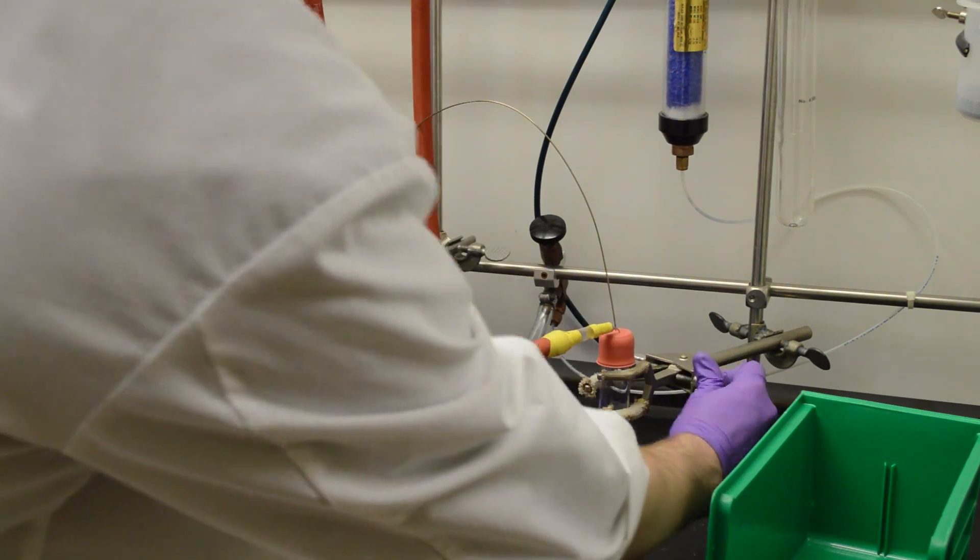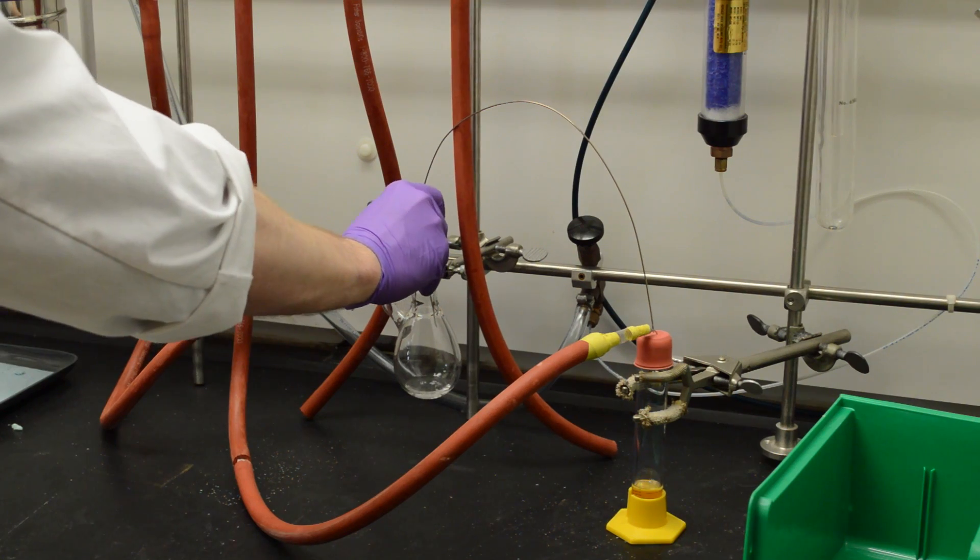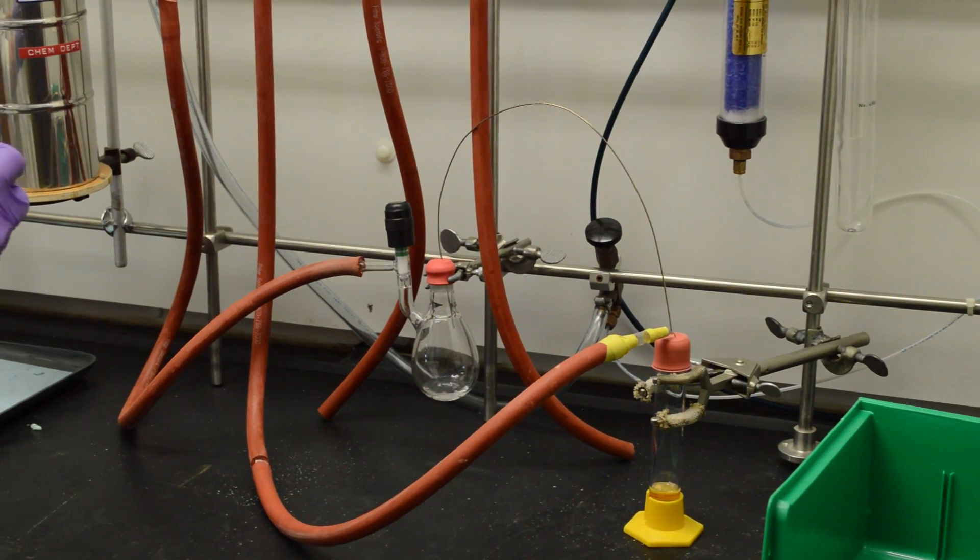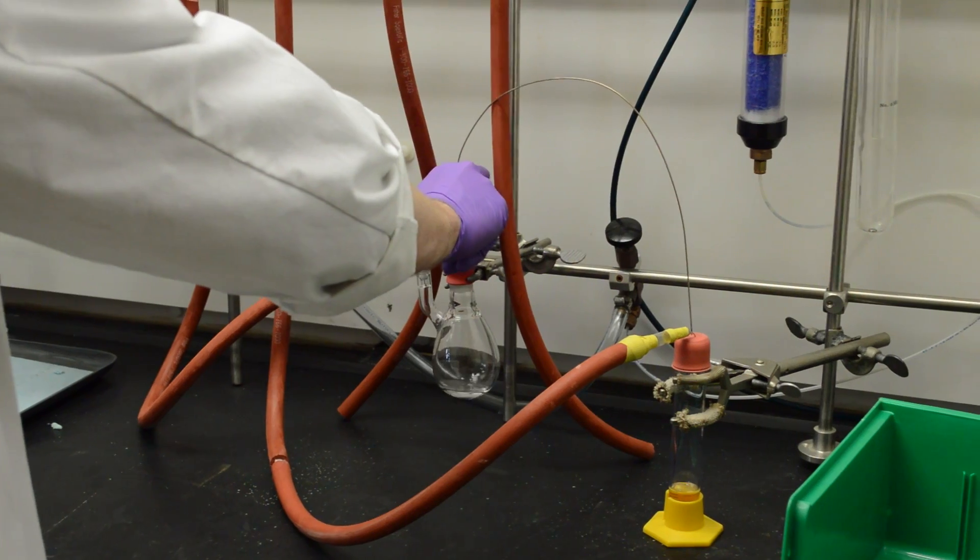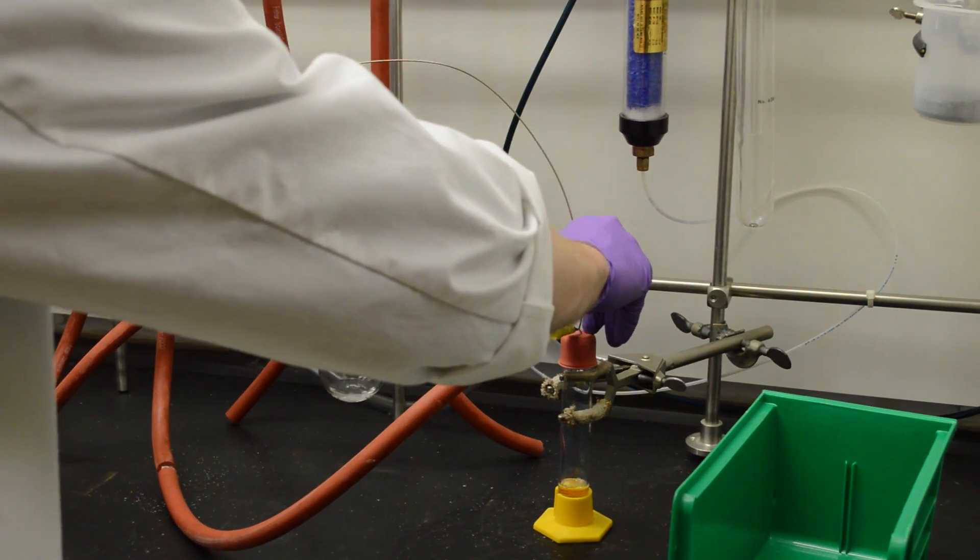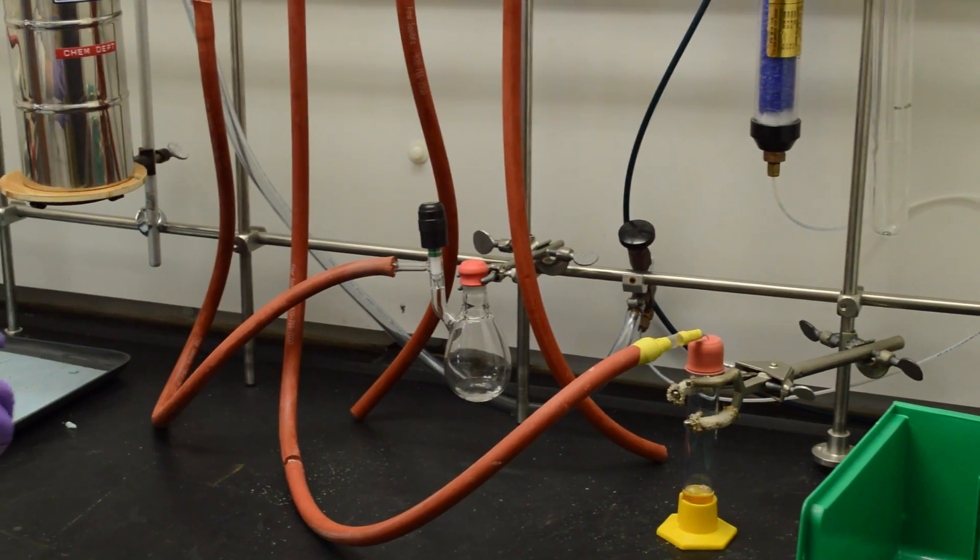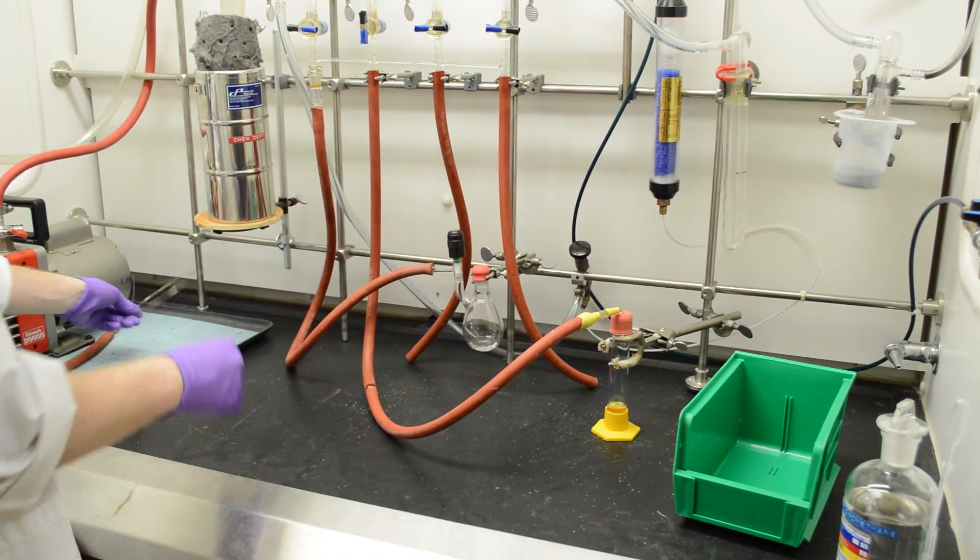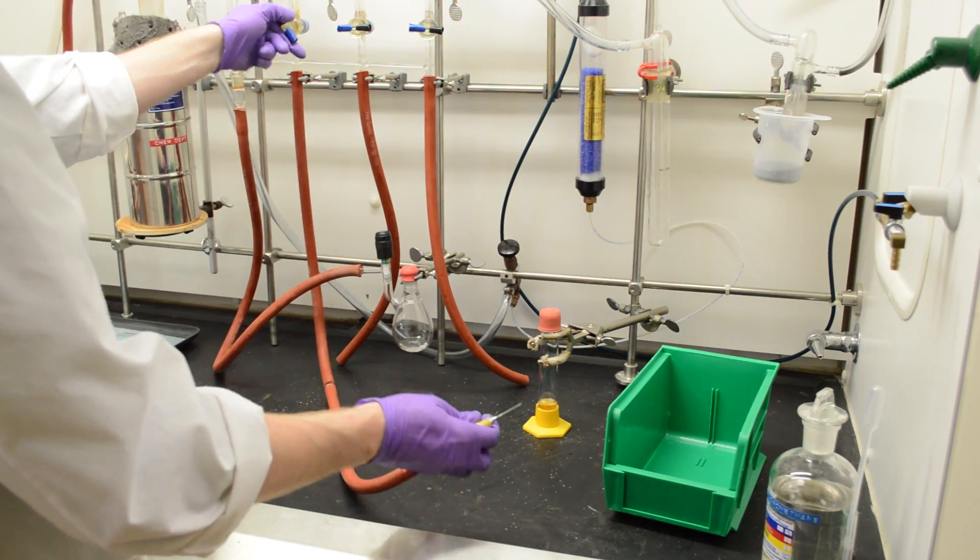So now we just need to work backwards to make sure that we don't contaminate the system with any oxygen. So you take out the small green needle first and just put it back in the cooler. And we can take this end of the cannula out, followed by this one. And finally, you can just remove the nitrogen from that and turn it off.